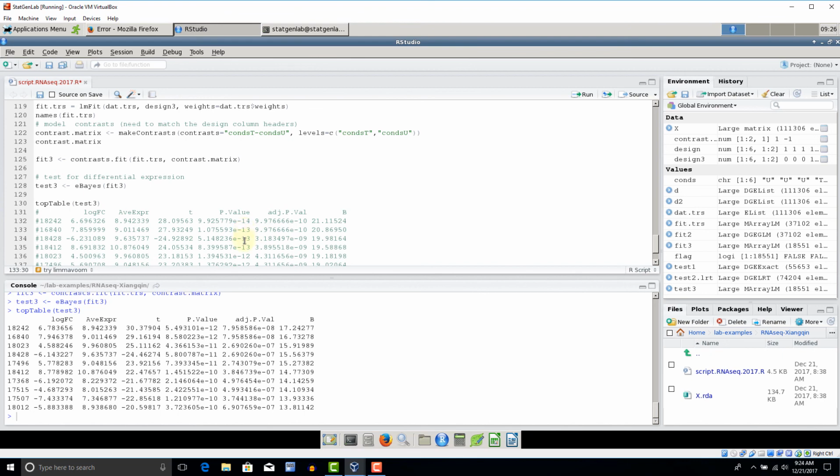And the important thing for using edgeR and some other statistical packages too is that you understand what method they're using and how to construct their design matrix. Also know how to find whether a design matrix is right or wrong. That's the key.